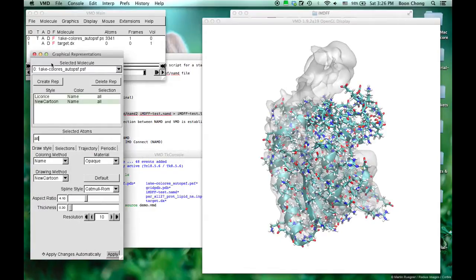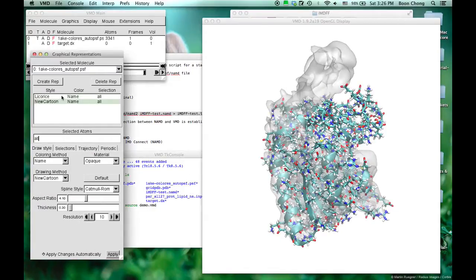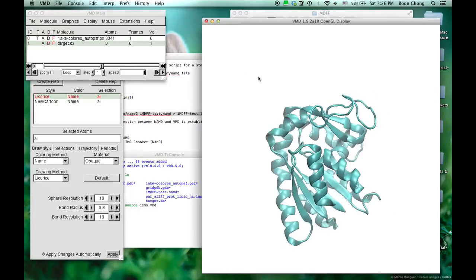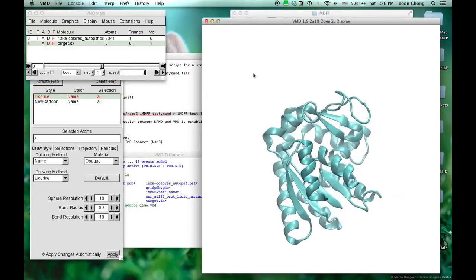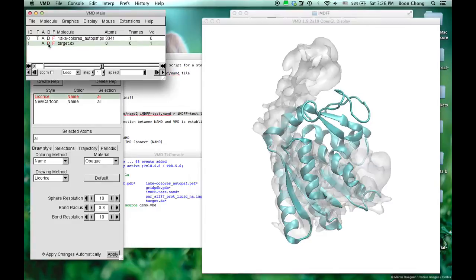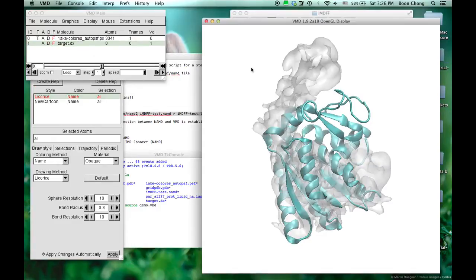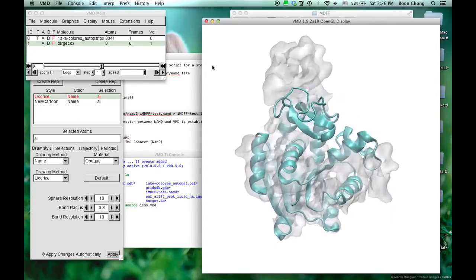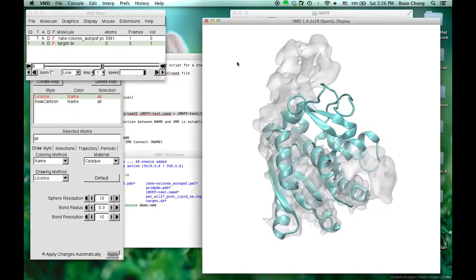We'll be able to see that this is the protein. It's a kinase, a small protein. And this is the target density map they want to fit it in.